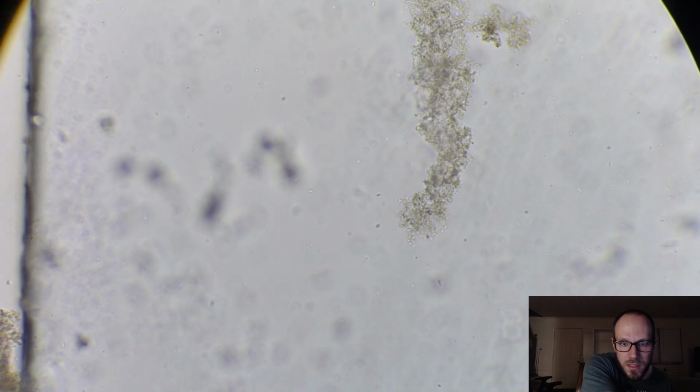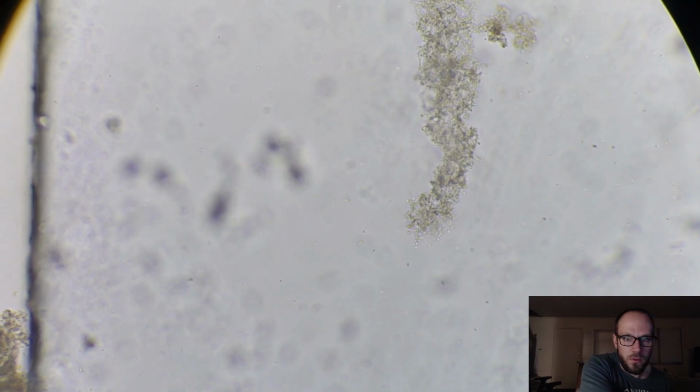And I think these guys are responsible for the coloration of the water. There appear to be fewer of them than there were before. I'm going to switch back to 40x. And you can see like the water has seeped out from under the cover slip a little. And yeah, there's just little guys swimming everywhere. Absolutely invisible to the naked eye.